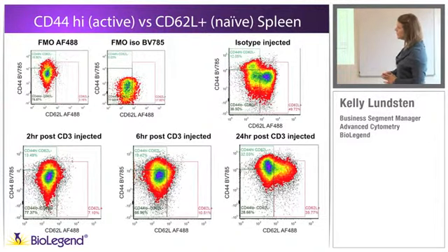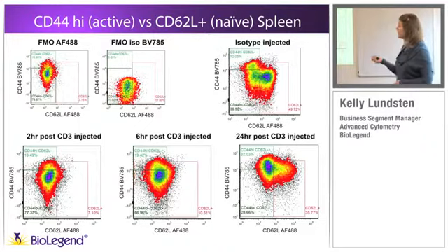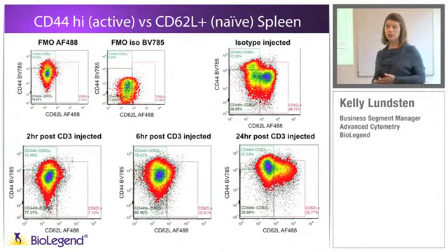So to move on to the different T cell subsets using CD44 and CD62L on Alexa 488 and on BV785, both of these fluorophores are considered to be relatively dim. However, when the cells become activated, your CD44 does increase in expression quite a lot. That's your activated cell population. However, the transition isn't always fluid. If I were to do this again, I would put both of these on slightly stronger markers or slightly brighter fluorophores in the hopes of being able to resolve them even better.